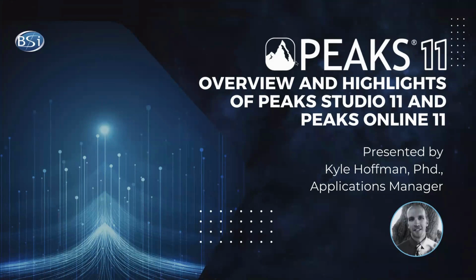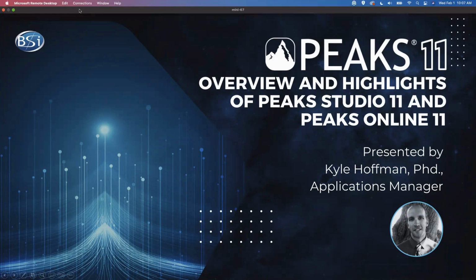So today is mainly meant to, like the title suggests, give a broad overview of everything. And then in following webinars, we will go into more detail about each of the features and different modules of Peaks 11.